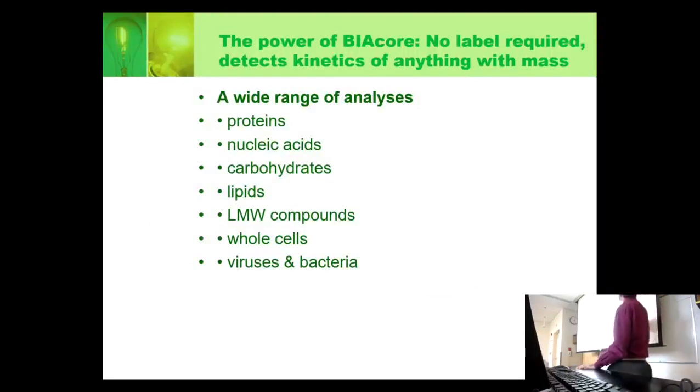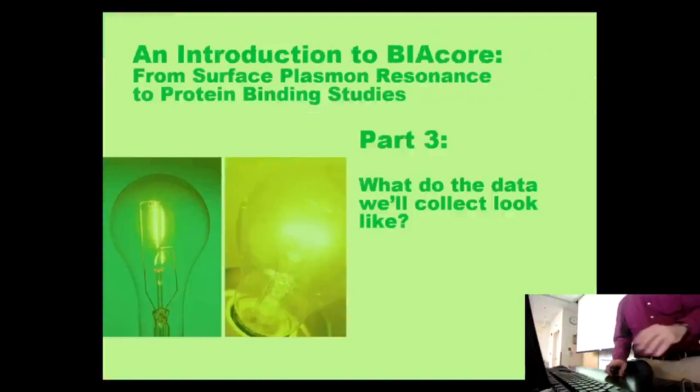BIAcore is really amazing because you don't have to label. Anything that has mass, anything on this list, you can actually use up to whole cells. And we have a situation where we're going to actually use the whole cells that I will talk about.